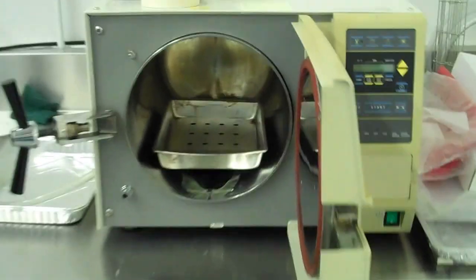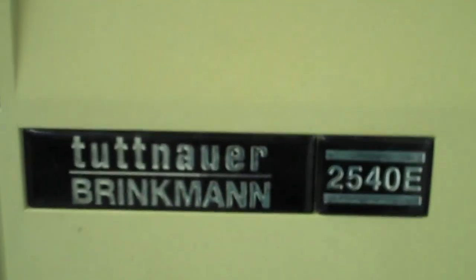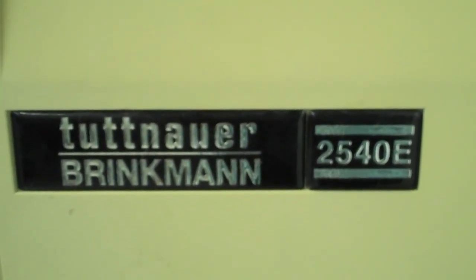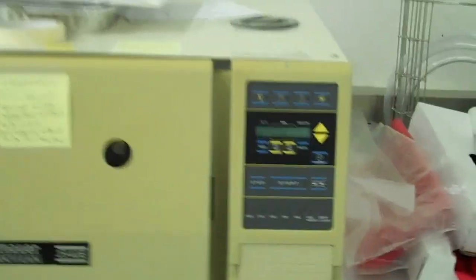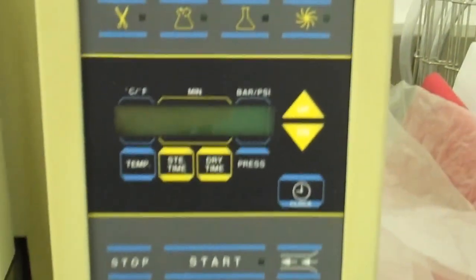Okay, this is the Tuttenauer Brinkman 2540E. This is an autoclave you use to sterilize things. There is a control panel and at the bottom there's a power switch.